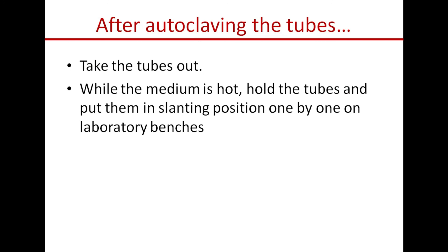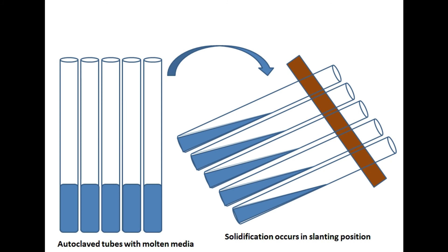After autoclaving, take the tubes out of the autoclave after the pressure goes down naturally. While the medium is still hot and molten, hold the tubes and put them in a slanting position one by one on a laboratory bench. Keep them in the slanting position to allow the media to solidify.